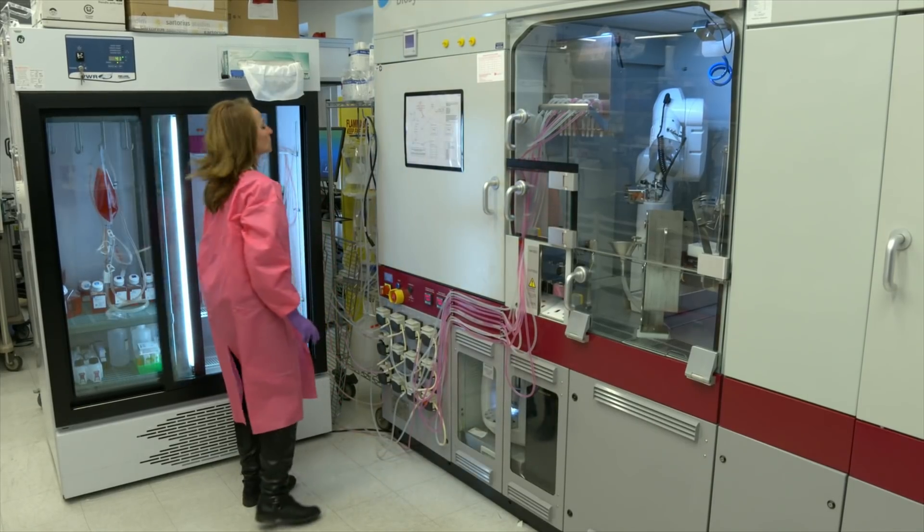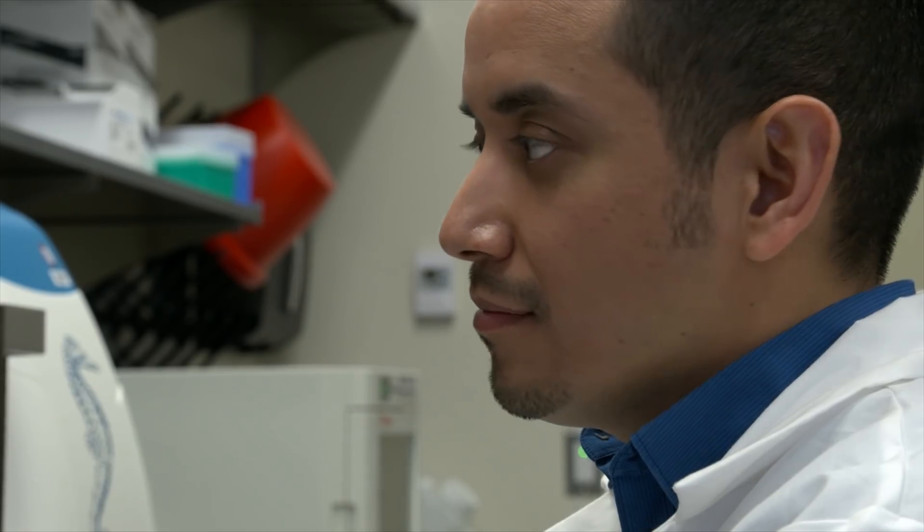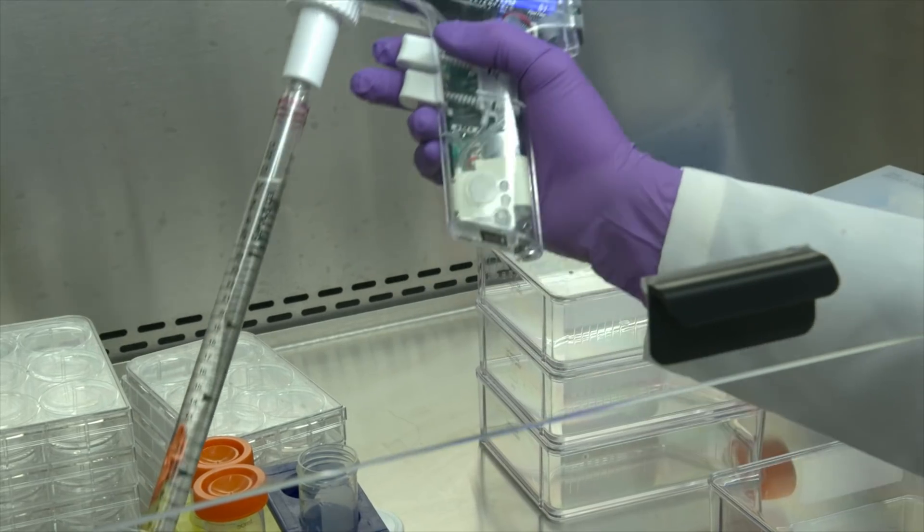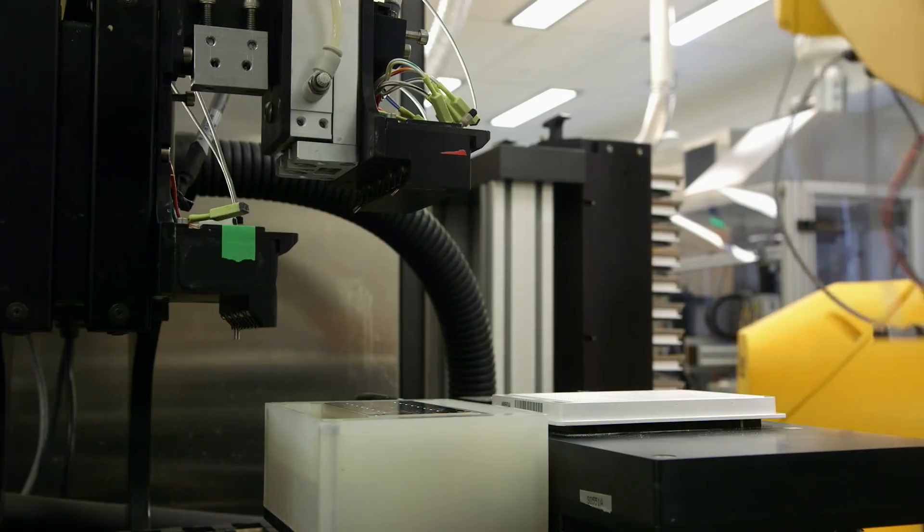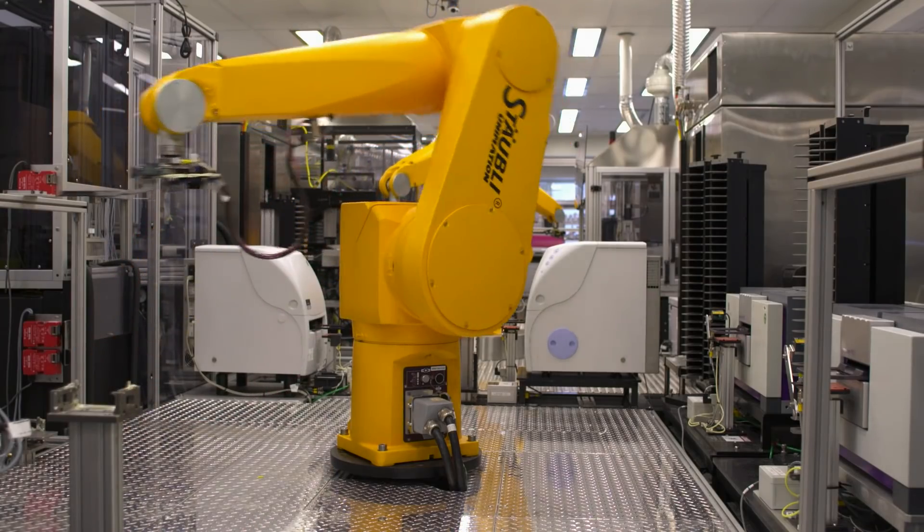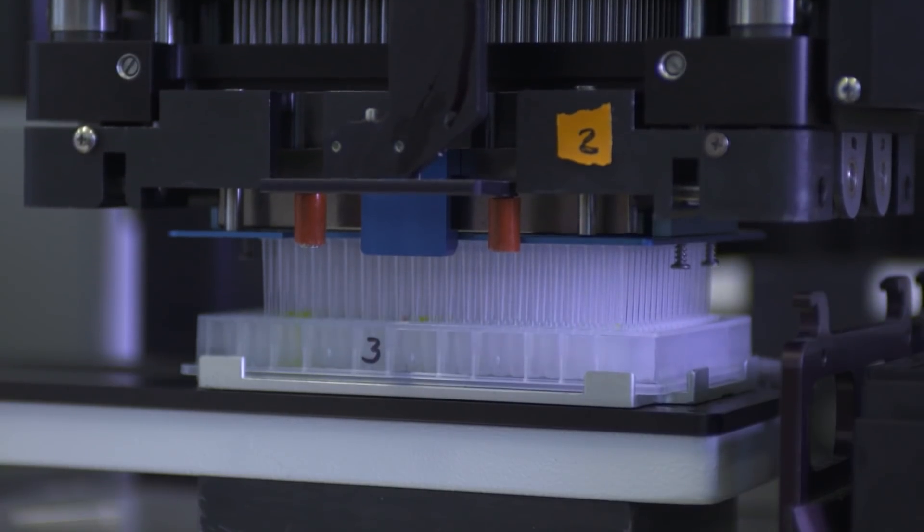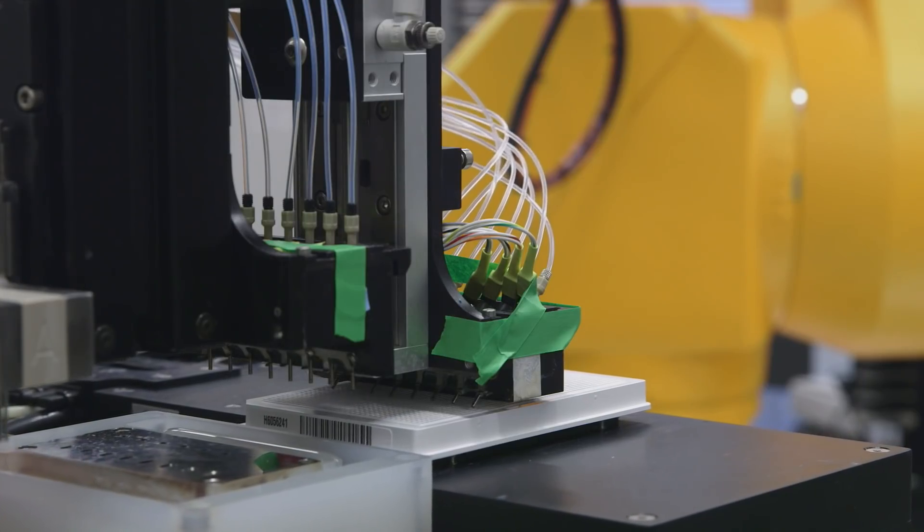Researchers at the Stem Cell Translation Laboratory also have access to various other NCATS resources. For instance, there's 3D bioprinting to generate new tissues and organs from stem cells. Another example is high-throughput robotic screening systems that enable more than 100,000 chemical, genetic, or biological tests in a single day. These tools may help scientists more quickly find solutions to public health epidemics, such as the opioid crisis.